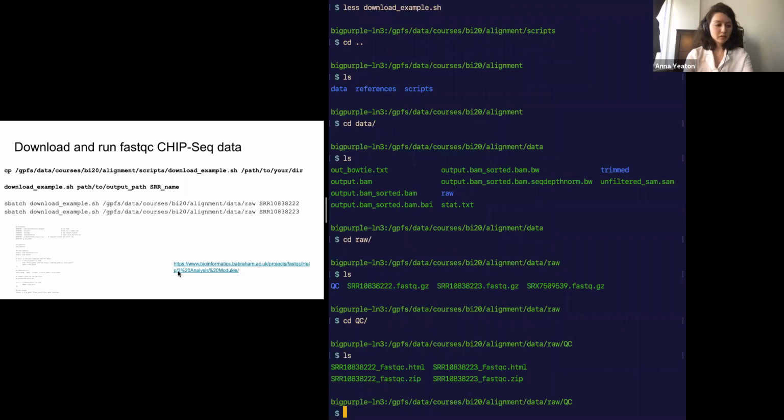The way you would run this is to sbatch your command like so. So nothing is being done on the head node. I've created sbatch files for everything, even for some of the jobs that are a little smaller, because I don't know if we would all get srun jobs if we were doing this interactively.